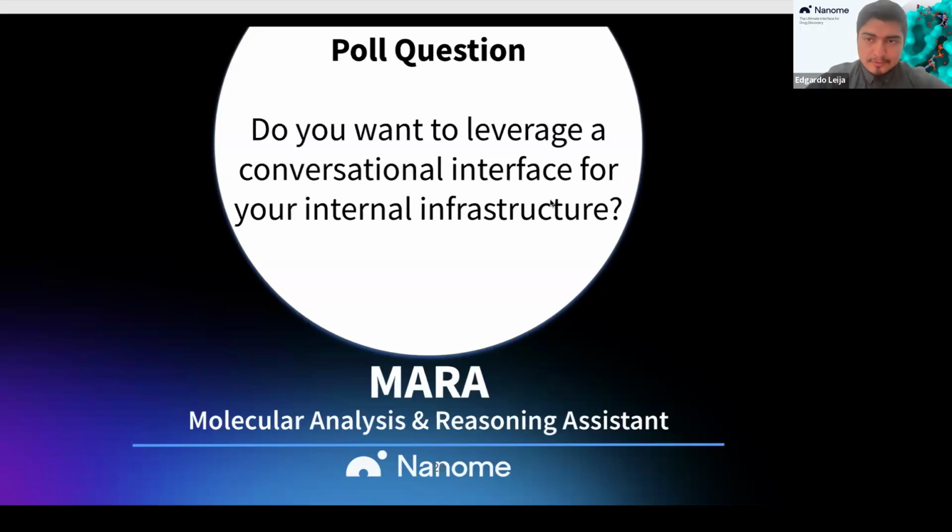Yeah, quick note on the public beta. There is also a runtime timeout. So that's something to watch out for. But yeah, that's not an issue in the enterprise deployments.